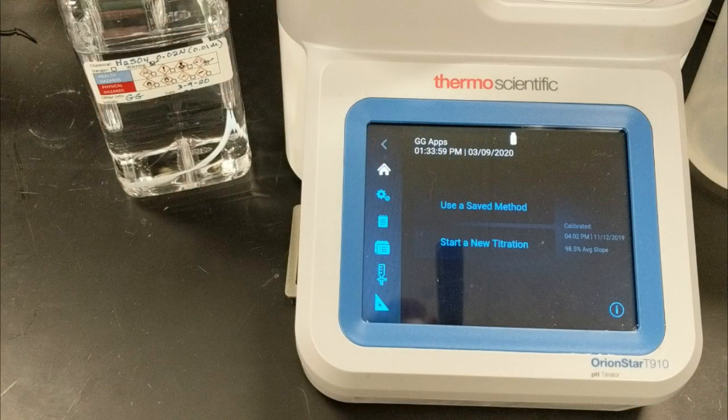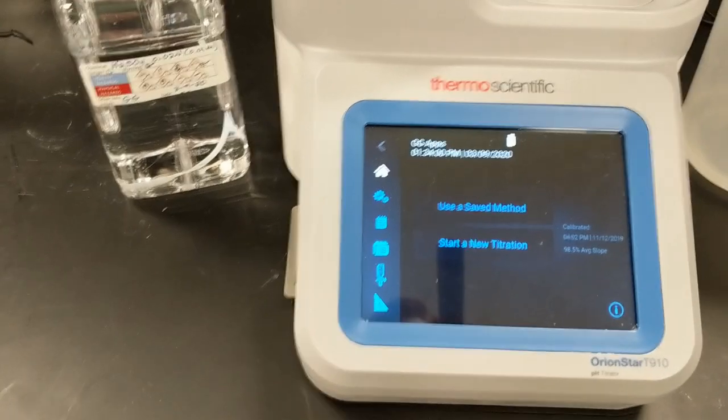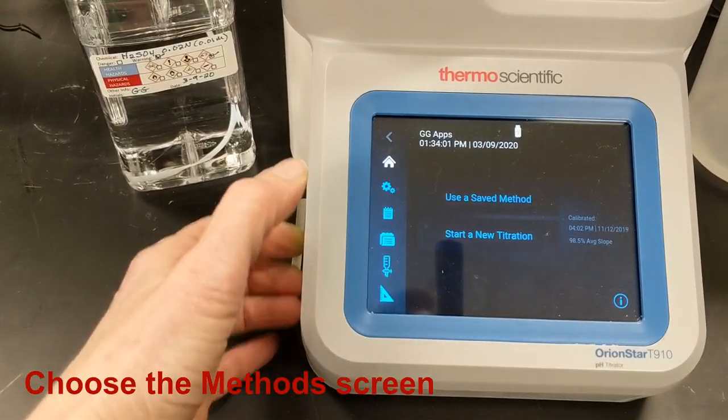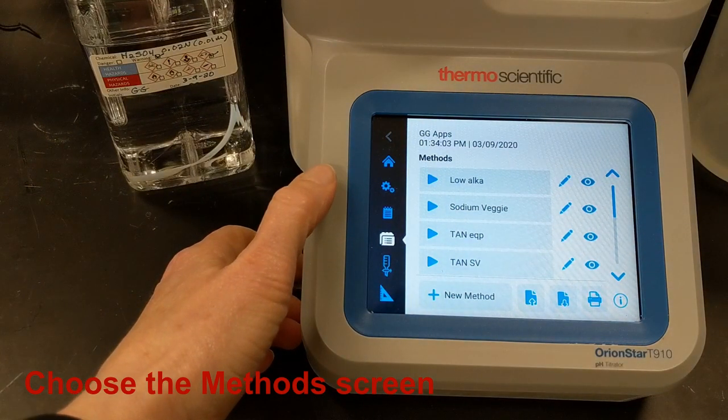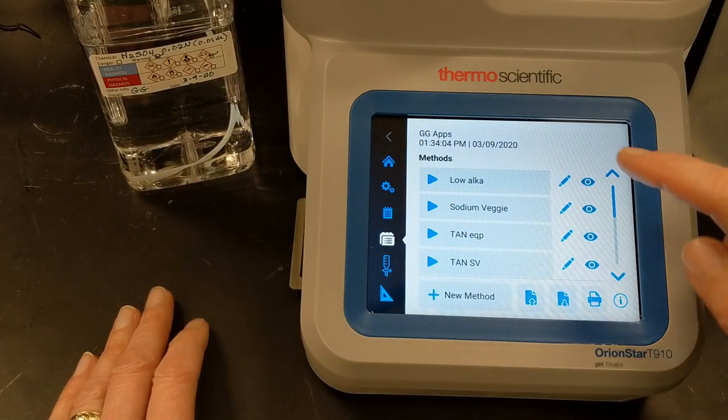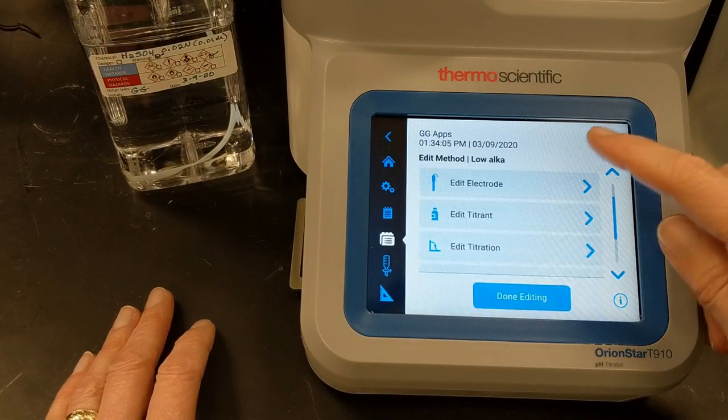I have programmed my Orion T900 series titrator with a low-level alkalinity method. Let's see what that program looks like. From my home screen, I touch the methods icon to see the methods programmed into my titrator. I touch the pencil icon to view or edit the low alka method.